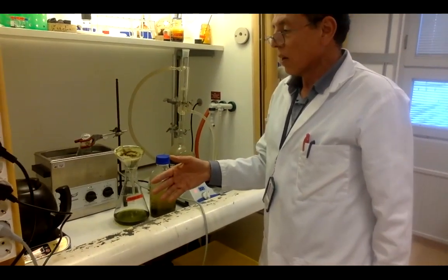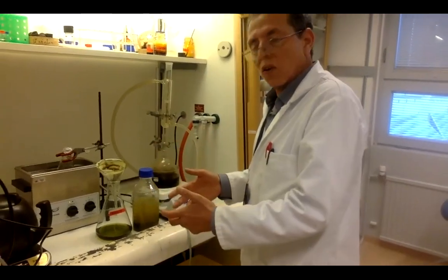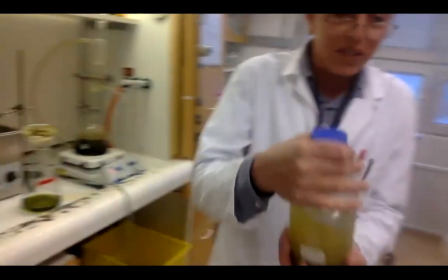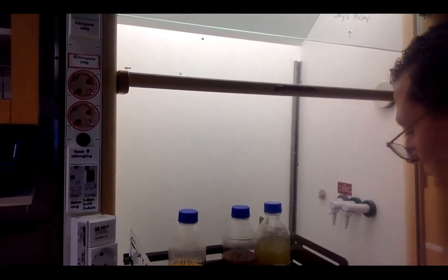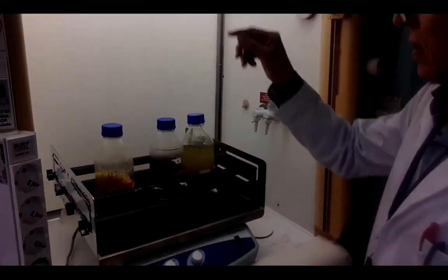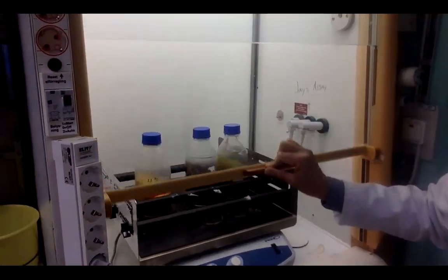If you know the targeted compound or the plant has been studied before and you know what you are looking for, you can use the other methods as well. I will now show you the shaker where you put the plant material overnight. This is the shaker, and this is the timer — it will stir overnight. It takes longer time than the other methods.